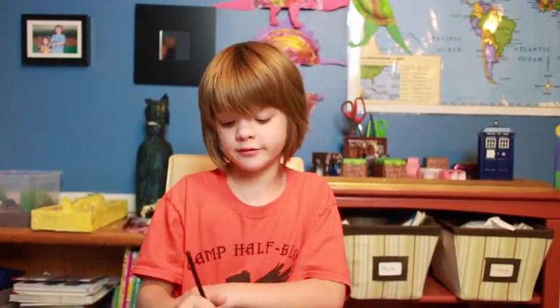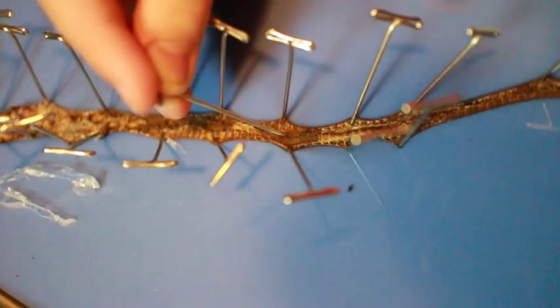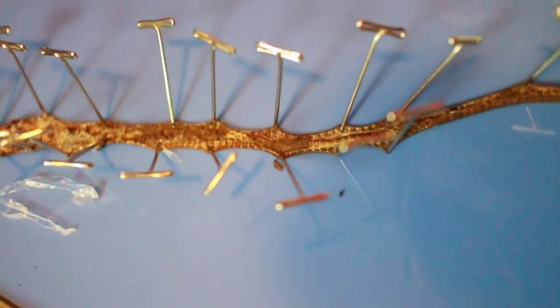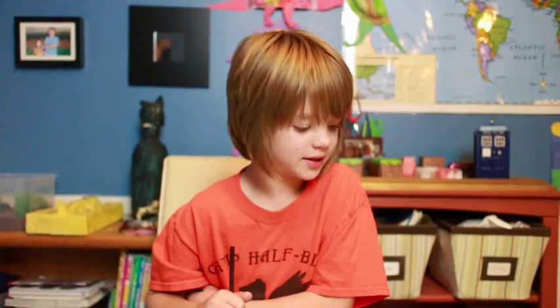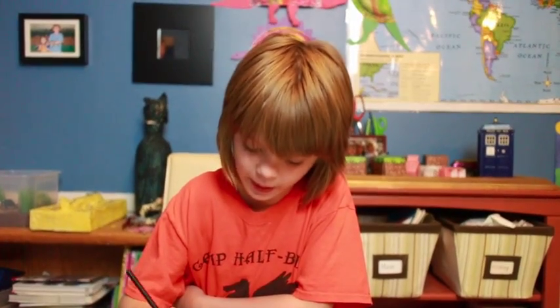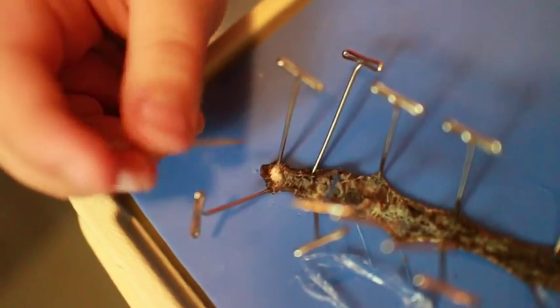Now let's move on to the anatomy of a worm. I learned a ton about the anatomy of a worm, so I'm going to go over some of my favorite things. Here is the intestine. You can see there's a lot of brown stuff by the intestine area — that's because I actually popped the intestine several times with my scalpel. Worms eat dirt, so the dirt is kind of all over the worm. And then right here at the top is the brain area, but the brain is super tiny so it's pretty hard to see.